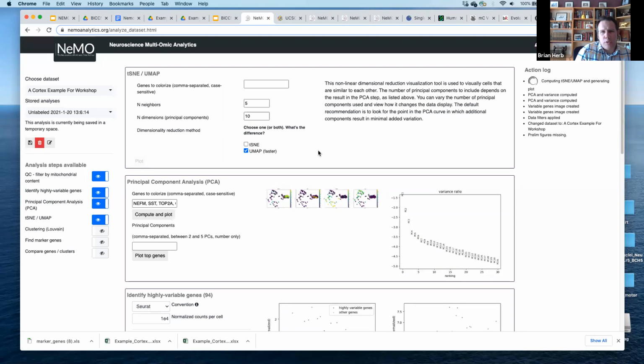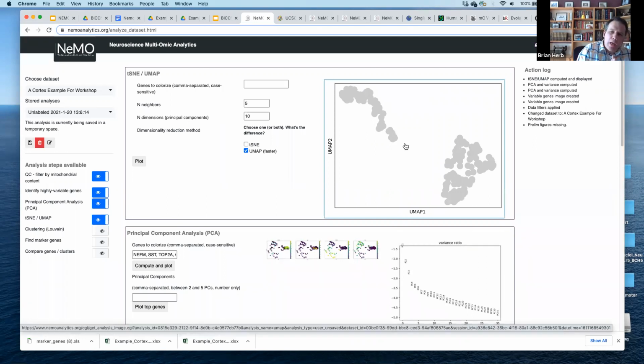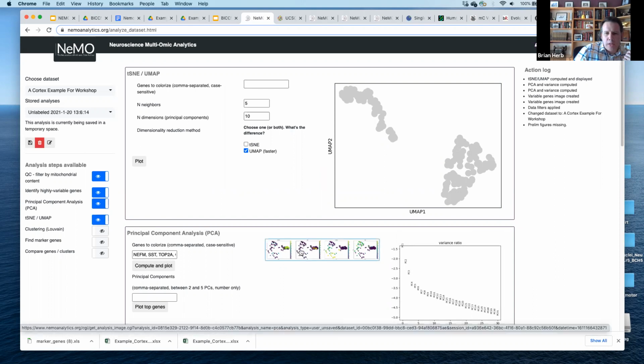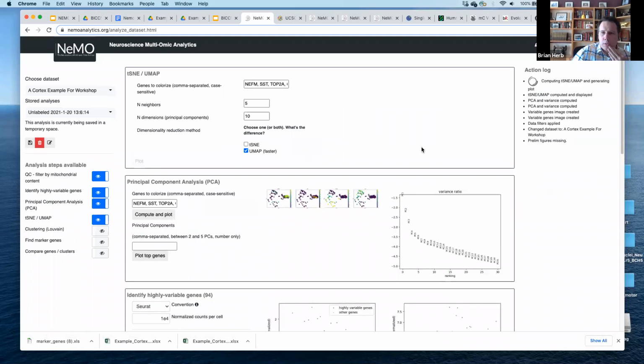So this is a classic view that you see all the time in papers now, how single cell data is represented in either this t-SNE or UMAP. And again, this starts to describe how similar the cells are together. And we see that right there. And we see that it's also concentrating all those cells that were more scattered out in my radial glial populations, and now they're a little bit more uniform. And that neuron cluster is still together, although now we're starting to see a little bit of structure within it. And just for kicks, let me just show you what those genes look like again.